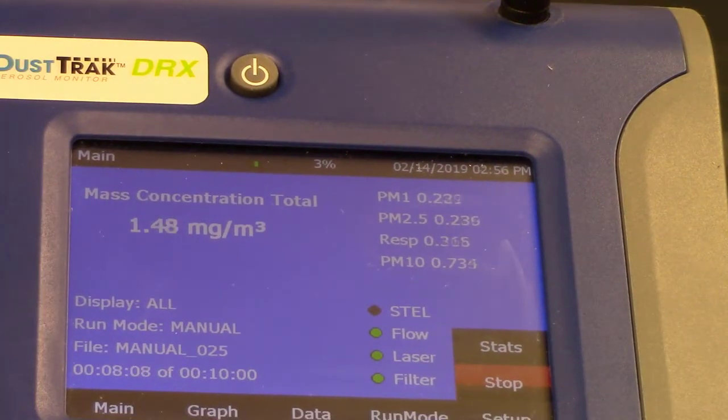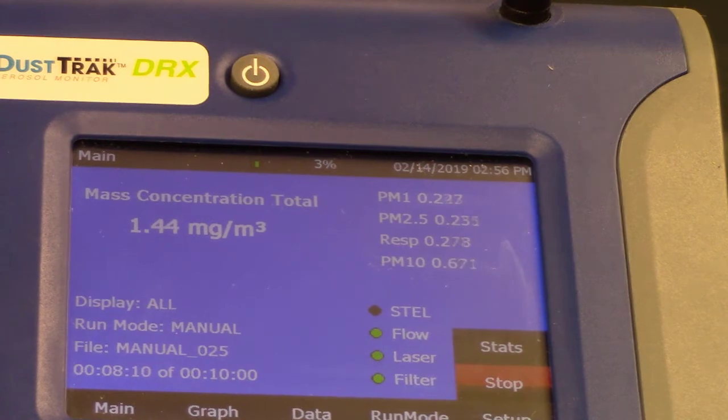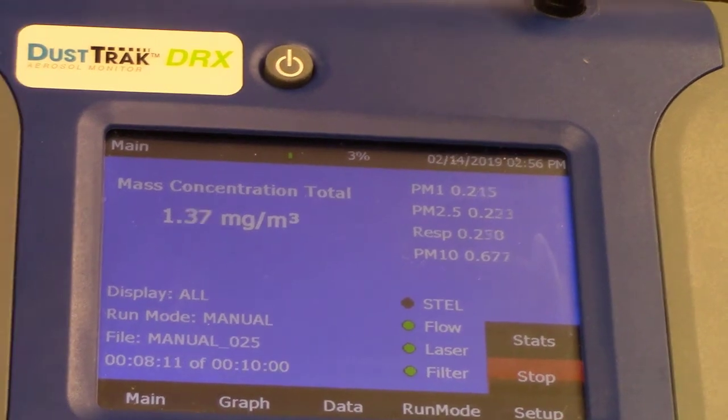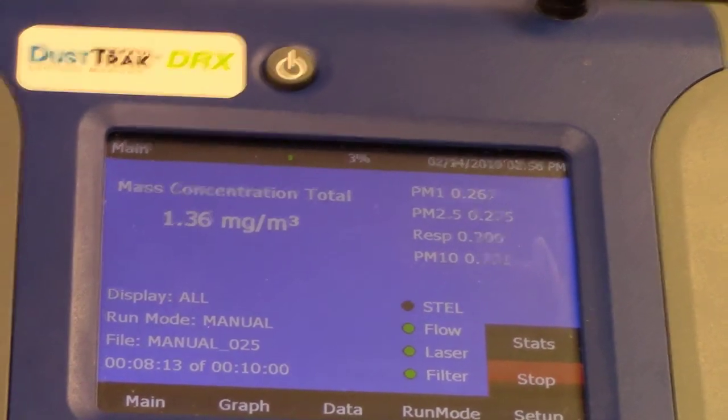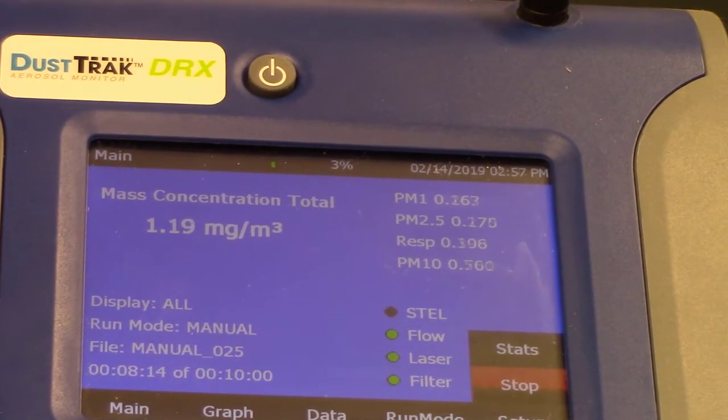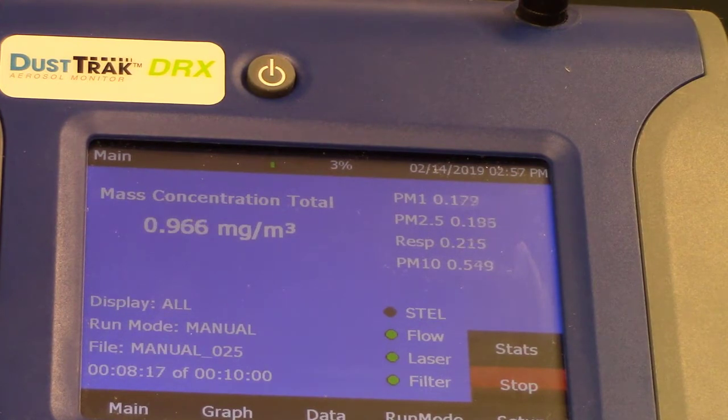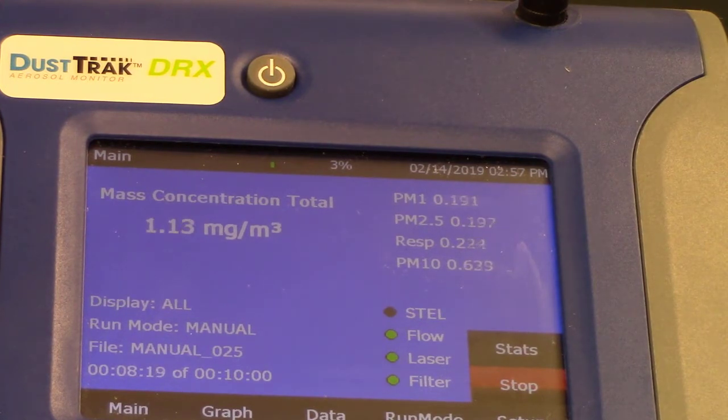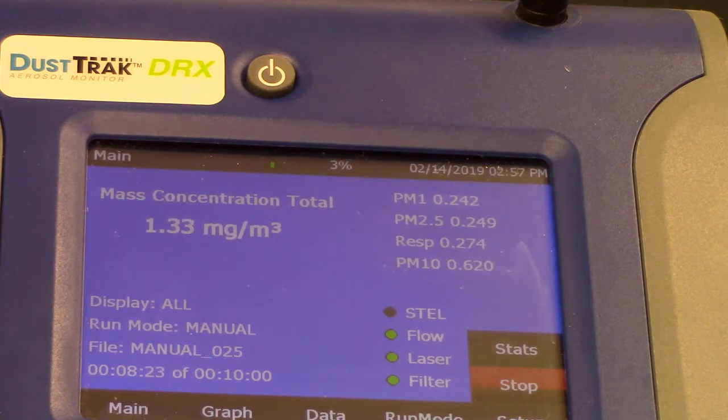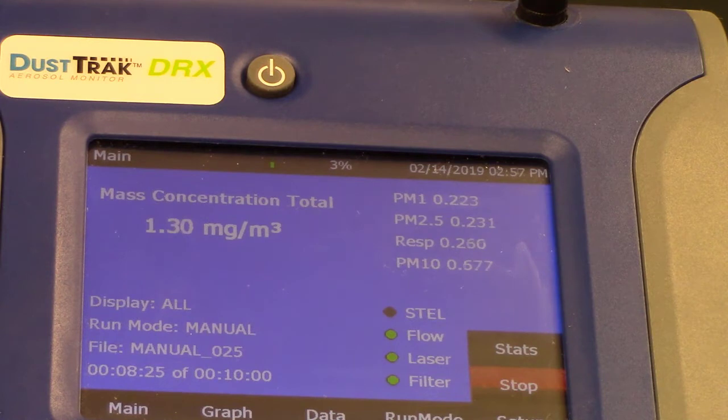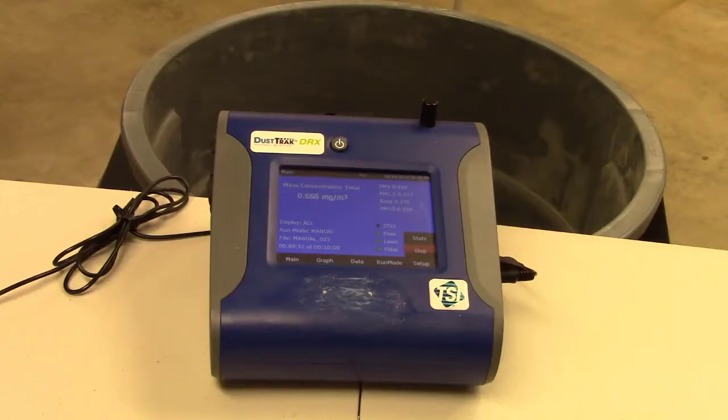We are at eight minutes and the mass concentration, the total mass concentration is all still changing. But it's slightly lower now that the particles being generated are not as much now that we've done with the action of pouring the cat litter. And I will jump to the end of the 10 minute mark.